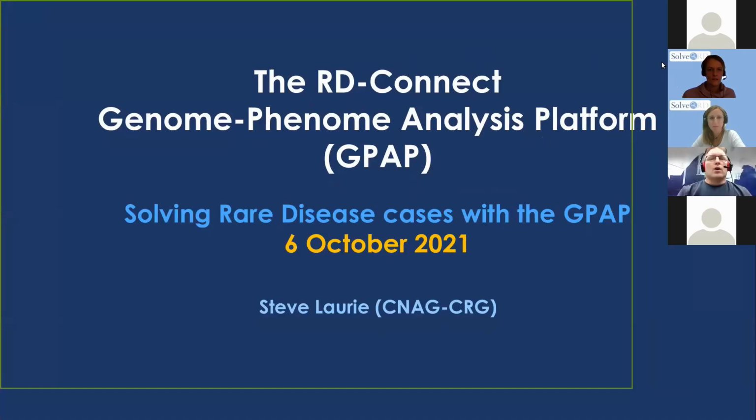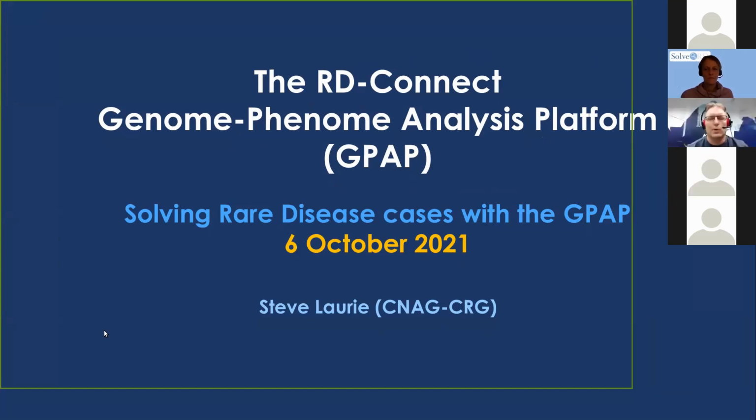Okay, thank you very much, Cornelia, for the introduction. So my idea today is maybe to take up about 35 minutes. And then we'll have some questions, 15 to 20 minutes available for questions at the end. So you can fill in the questions in the chat box as you go along. I'm going to start with a brief presentation that will take 5 to 10 minutes, and then I'm going to show you a demonstration of the GPAP in real time.